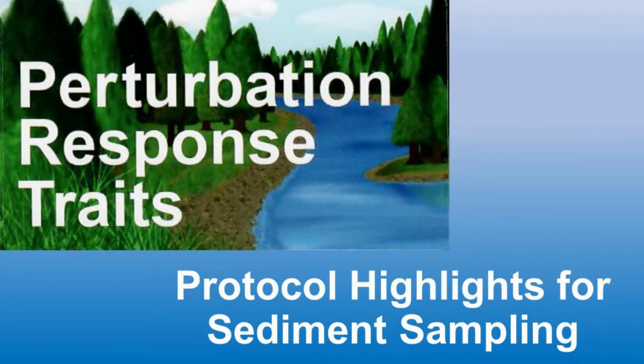This protocol describes sediment sampling and I-button retrieval for the Perturbation Response Traits project. 2 people are needed to accomplish this protocol. We recommend wearing safety glasses due to working with liquid chemical RNA later. The MSDS is included in the box.